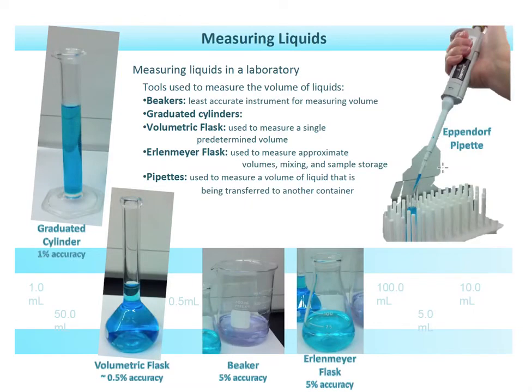So, measuring with tick marks. Sometimes that can throw people because there are different tick marks on different things. Like a graduated cylinder, a little one may have more tick marks, a large one may have less tick marks. So you look at the tick mark and you go one place beyond. So if this graduated cylinder measures 1 milliliters, you write it to the tenths place.